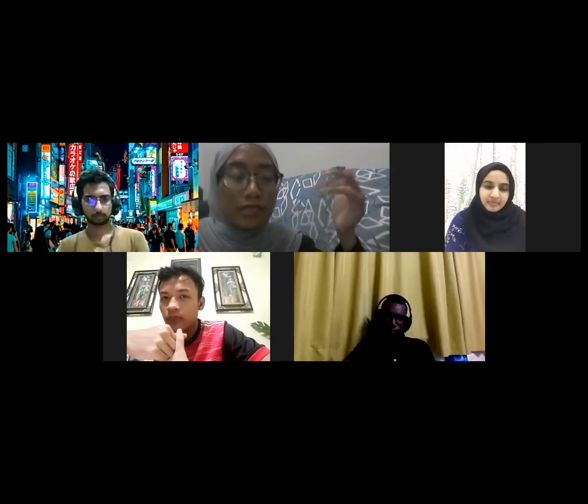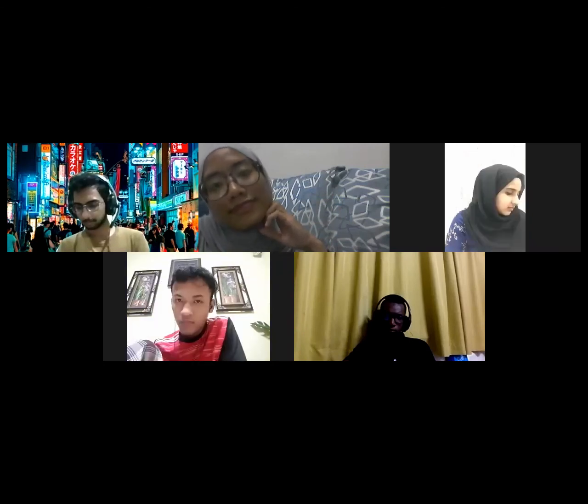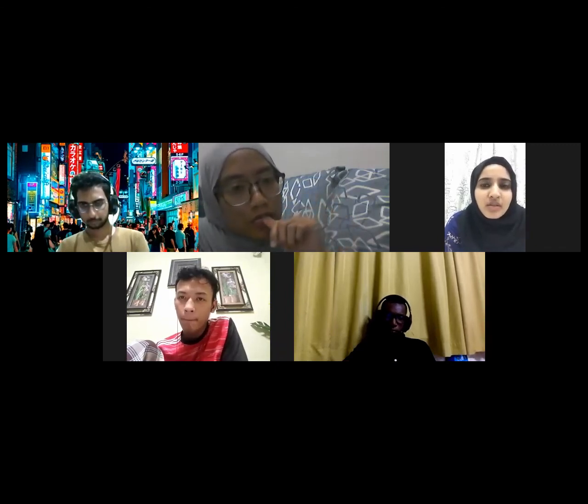Maybe 6 is still okay, we don't know. I think we need to do a bit more reading on that. 6 is actually high. 3 to 4 is quite okay. I think the good one is 1, 0.